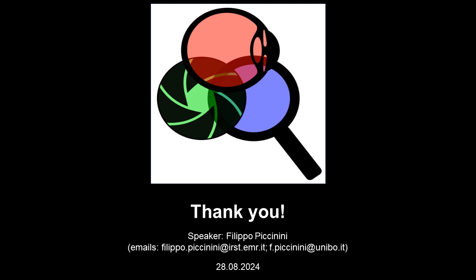Okay, you have now watched the first video tutorial about ColorimetryDT. Please, before analyzing your data, download the sample dataset, play with it, read the manual, and learn how to use the tool. Thank you for your attention.